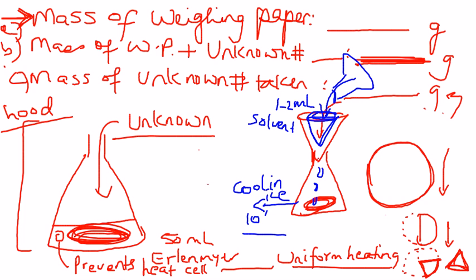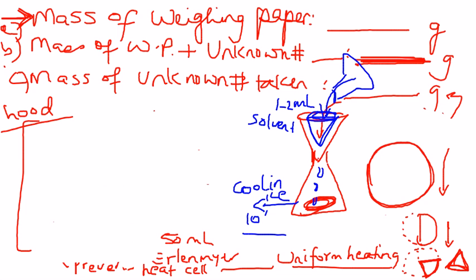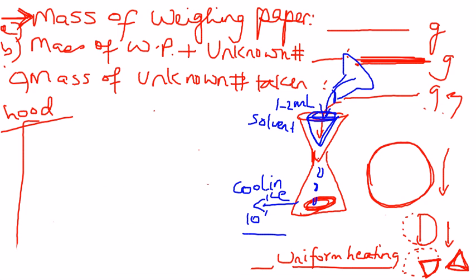And then you should see a solid, and your aim then is to filter it on a Buchner funnel and get a melting point. So what you'll then do is set up a Buchner funnel. You are supposed to clamp it.